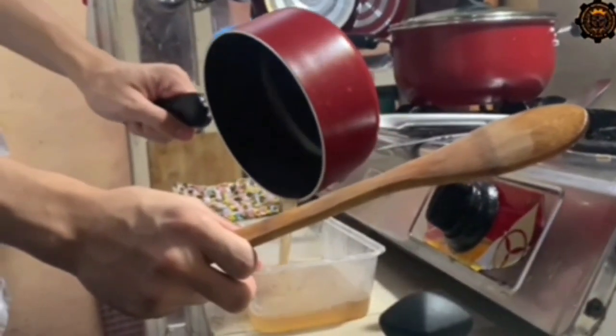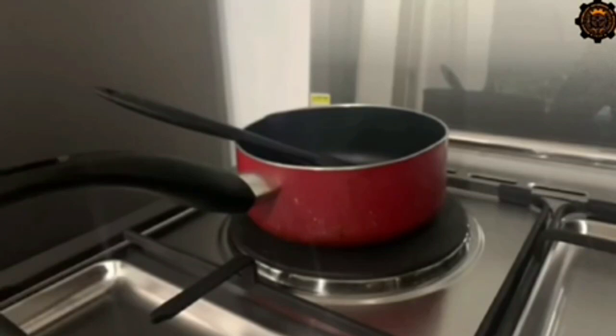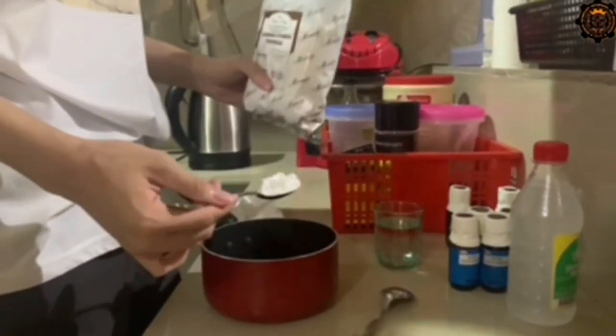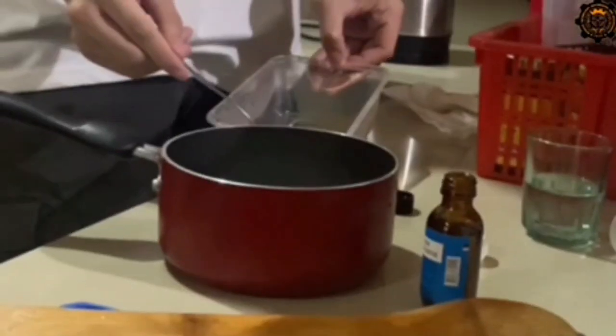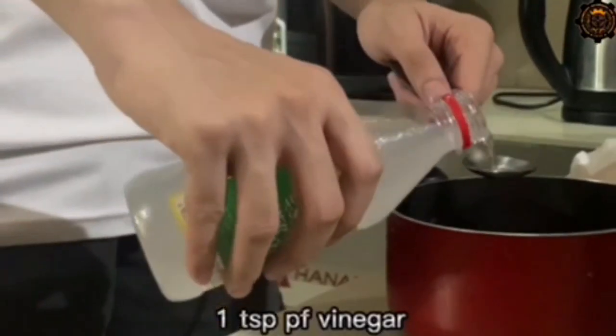Making the bioplastic: the researchers started to measure the amount of cassava starch and jackfruit by-product that will be put into the mixture, along with glycerol, vinegar, and water.